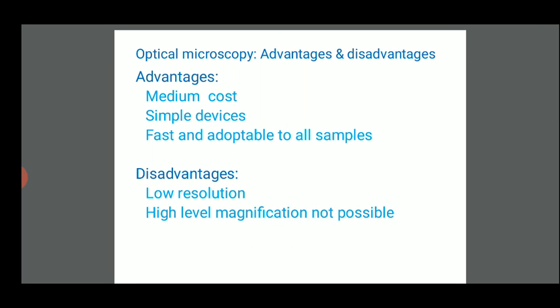And these optical microscopes, the applications involve microelectronics and medical diagnosis, in biotechnology, as well as nanophysics.